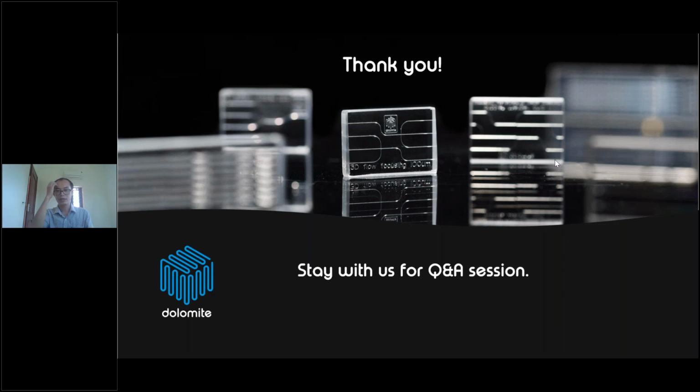So it's very helpful for your temperature control process. Now we are developing the temperature control for the sample loop that can allow you to control the temperature of your reagent contained in the sample loop. However, it's not released at this moment. It's in process, so we will release it very soon. I hope this helps.